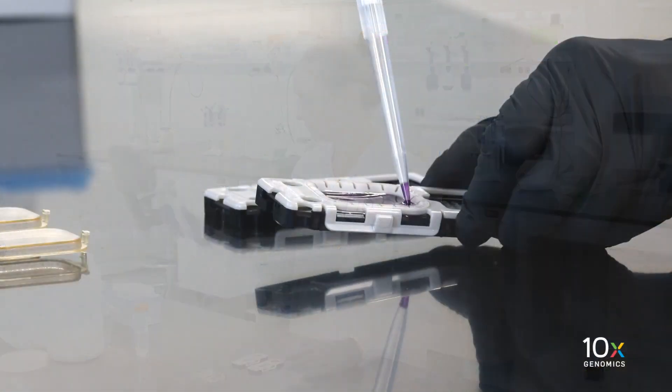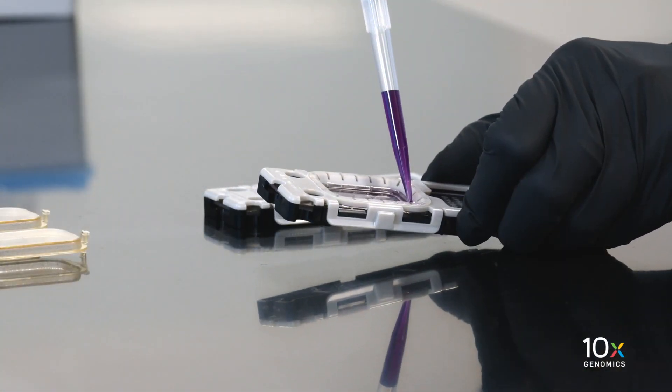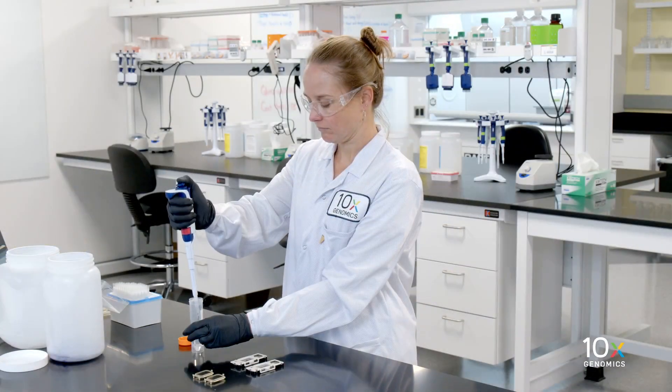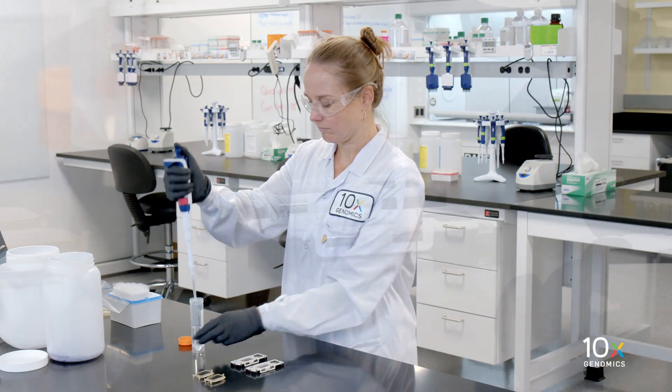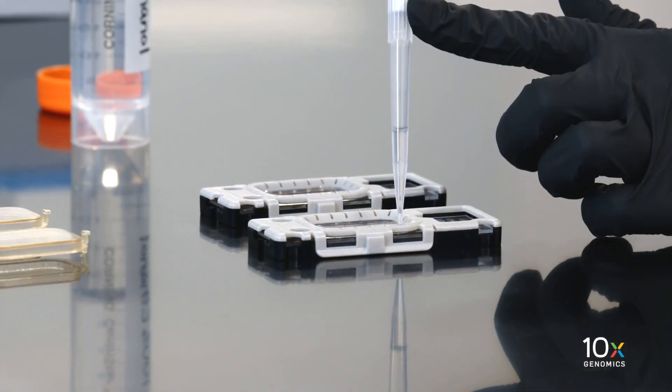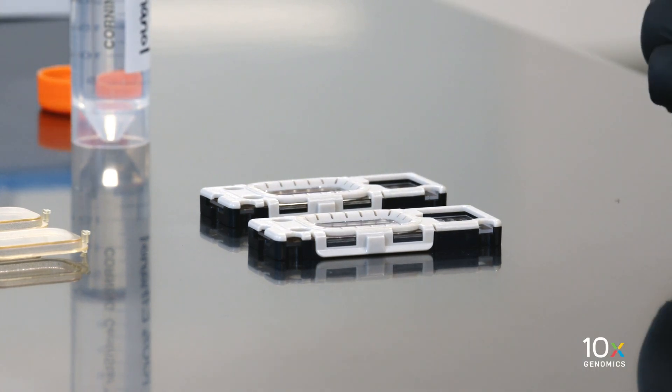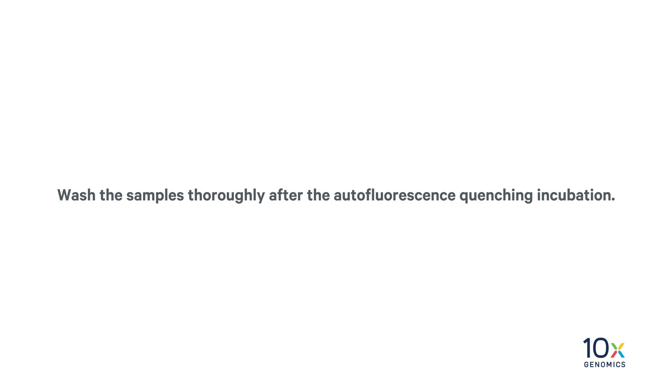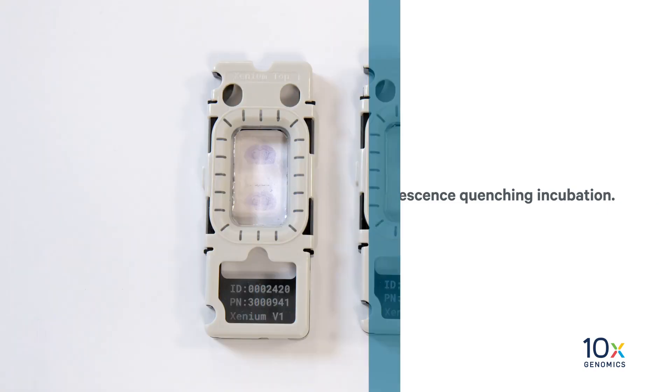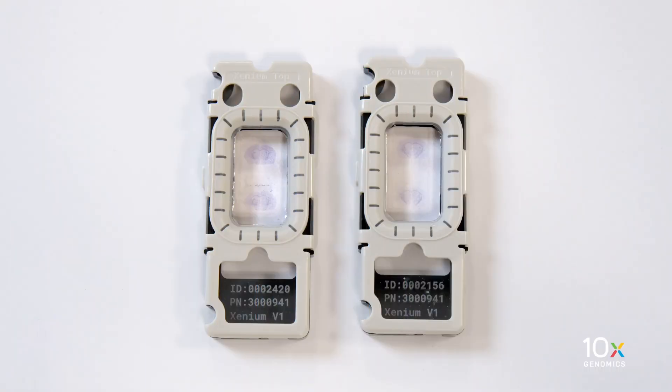After incubation, remove the quencher from the well. Wash the slide to remove any excess reagent. For this video, we will only perform a single wash. However, the protocol requires two additional washes. Wash samples thoroughly after the autofluorescence quenching incubation. A quenched sample shows a uniform light purple color on the tissue surface.